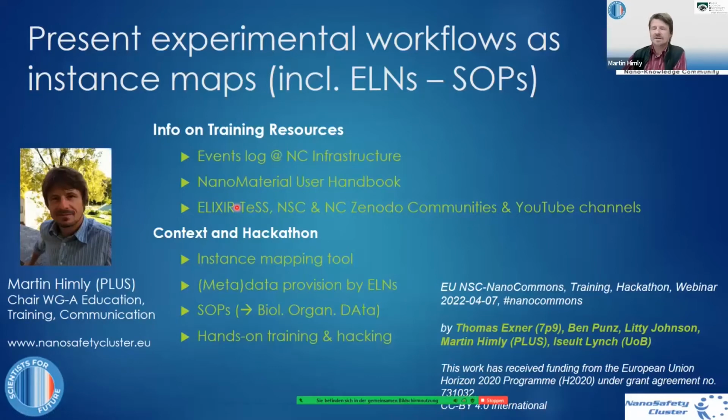So what are we going to do today? First I give just a very few glimpses of what we have done so far on training events, where you find materials for that, and then a short overview of what we are going to do today. We are going to look into what the instance mapping tool can provide.